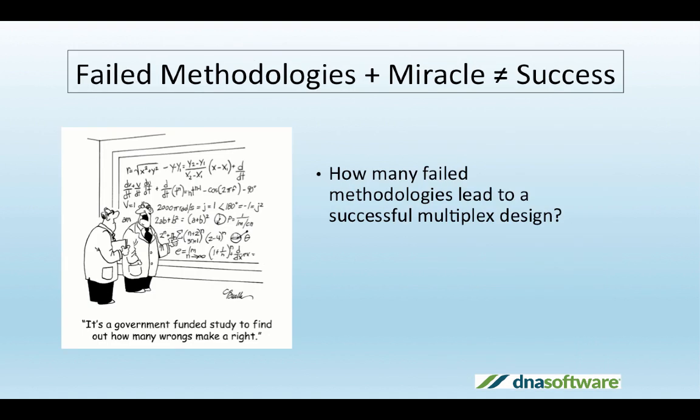But what happens when you have a nice set of primers that work well in a singleplex? Shouldn't you be able to just mix experimentally validated singleplexes into a multiplex with just a few tweaks? You likely are watching this video because you know that assumption is incorrect. In actuality, primers will act differently around other primers and targets, which means that your problems have now gotten ten times more difficult.